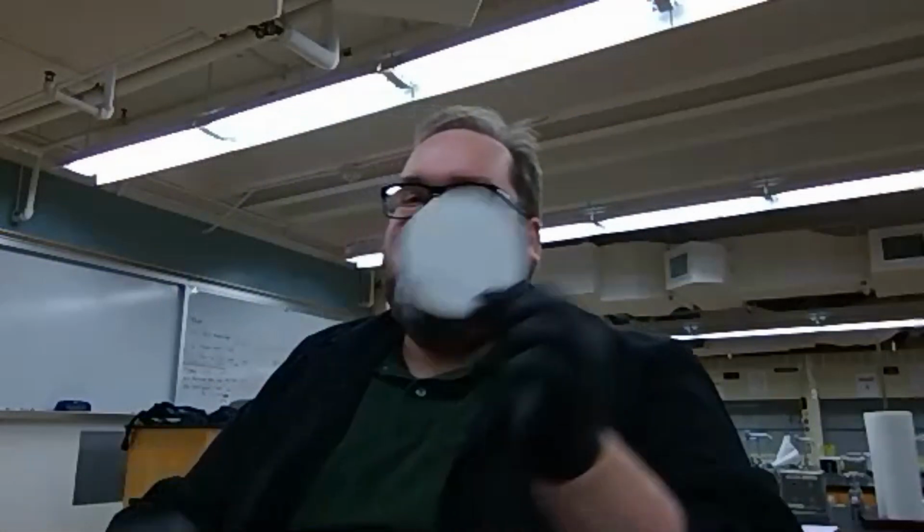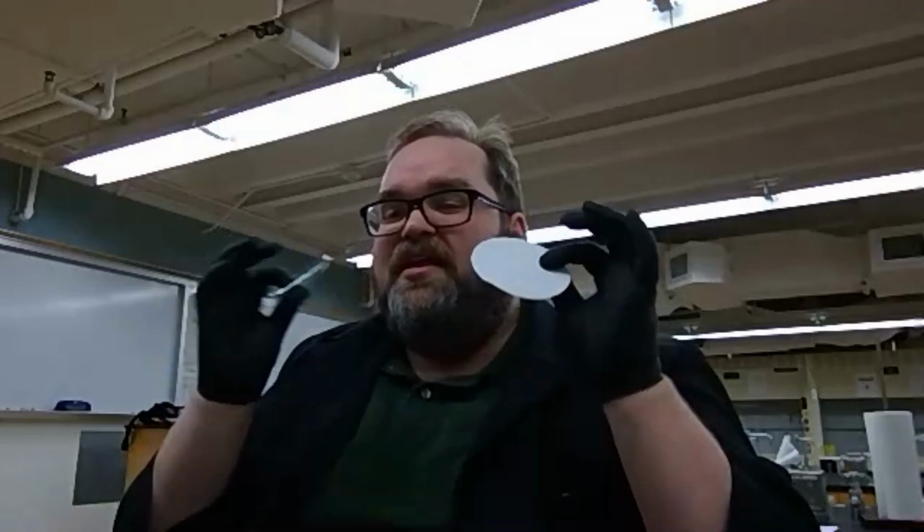Okay, we're gonna need a couple of stir rods. We're gonna need a scoopula. We're going to need at least one watch glass and at least one piece of filter paper. Okay, we're also going to obtain the mass of the watch glass and the filter paper together and separately. That's going to help us with some of our calculations at the end. So I'm going to go get those masses, and then I'm going to show you how to set up this. Actually, let's show you how to set up that contraption first.